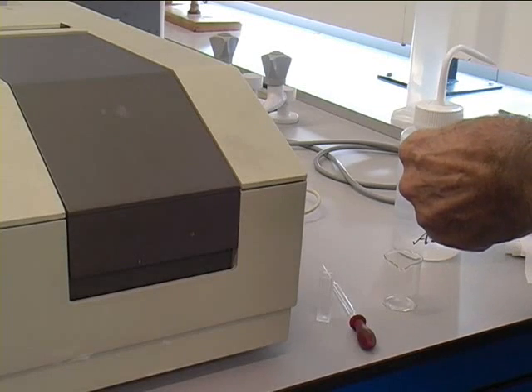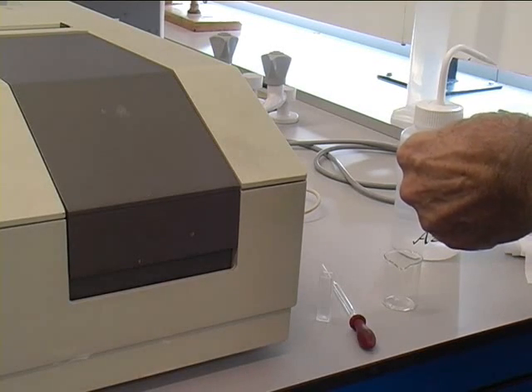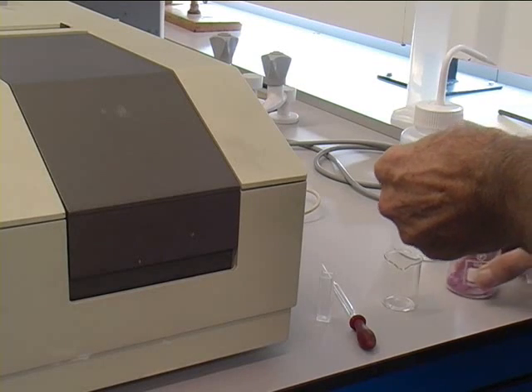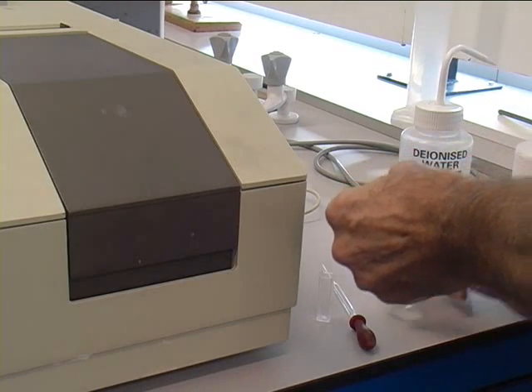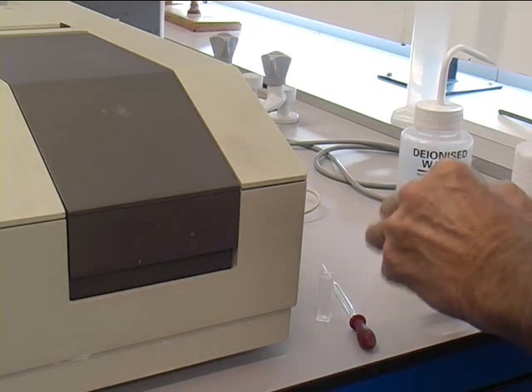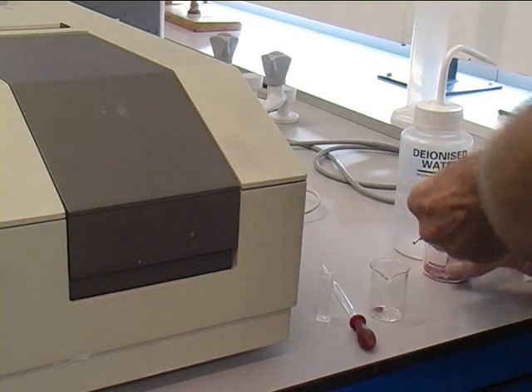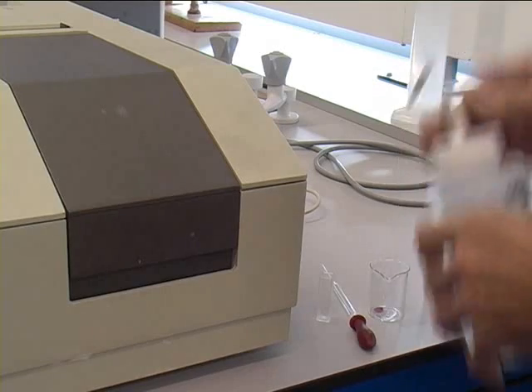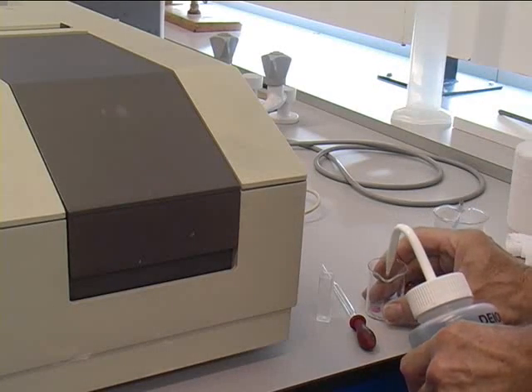To run your sample, take a small part of your sample, typically the end of a spatula, place into a beaker and dissolve in deionized water.